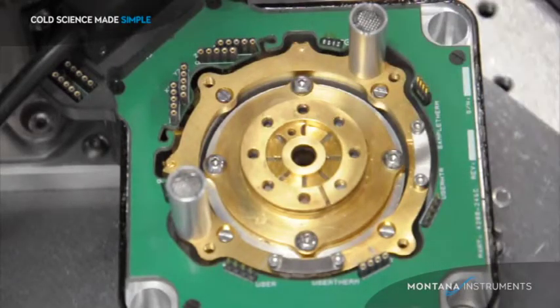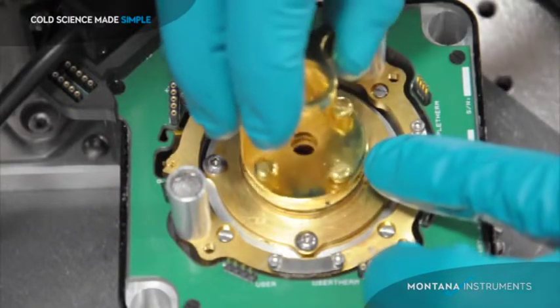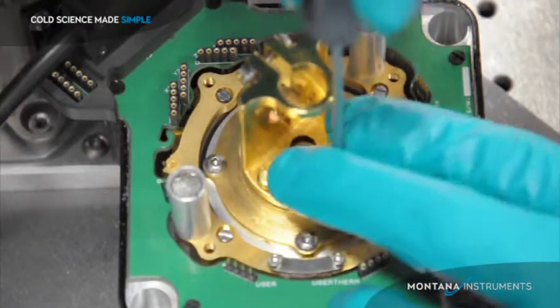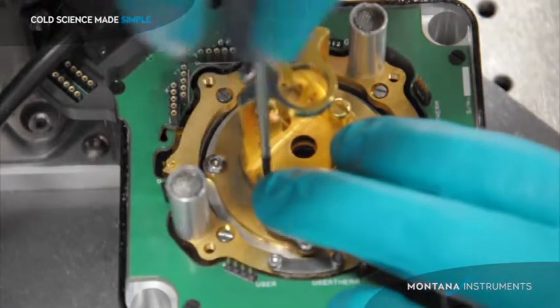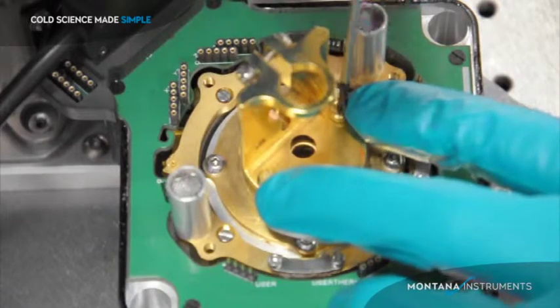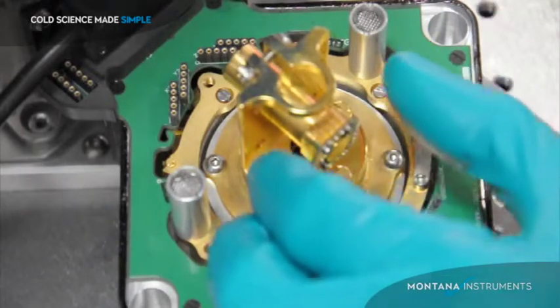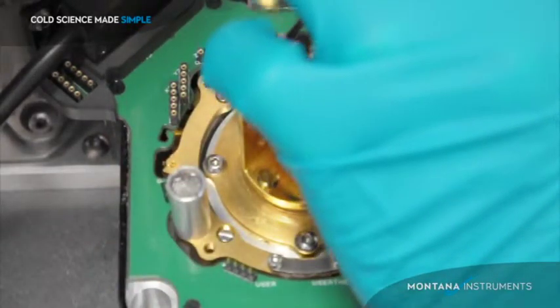There are eight holes in the sample platform so that the grip bracket may be mounted at any 45-degree step. There are four brass screws which hold the bracket down to the platform. Be sure to tighten these firmly so you get good thermal connection up to the bracket. When you are done with this, you can install the sample post. Be sure to tighten it in place as well so you have a good thermal connection out to your post and then ultimately to your sample.